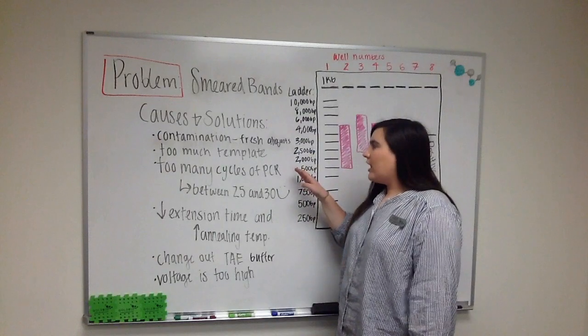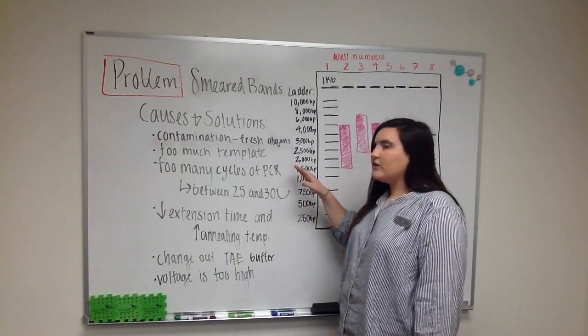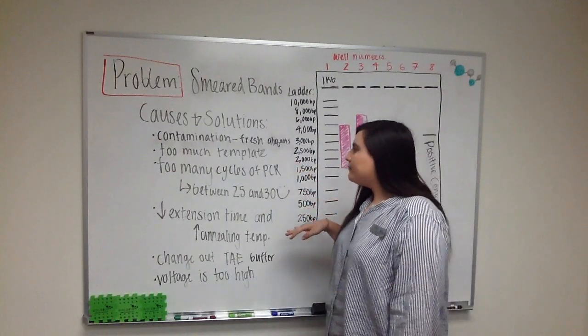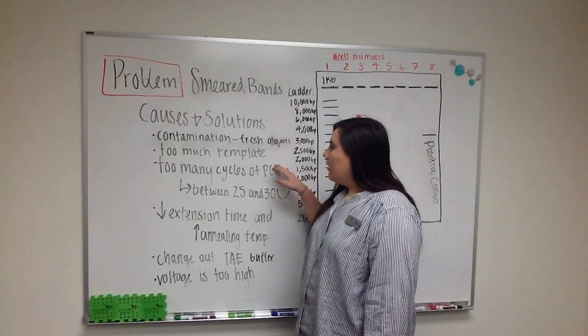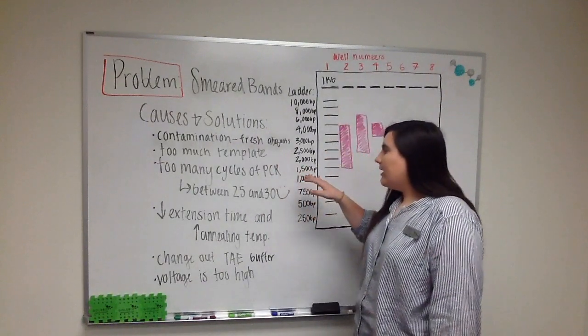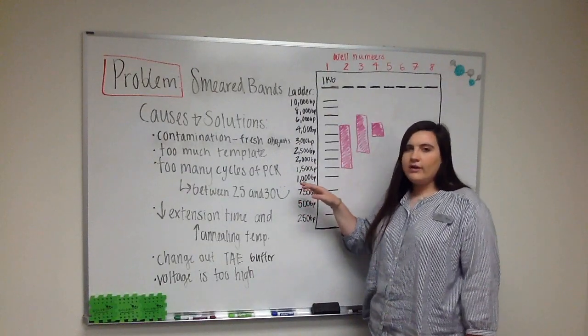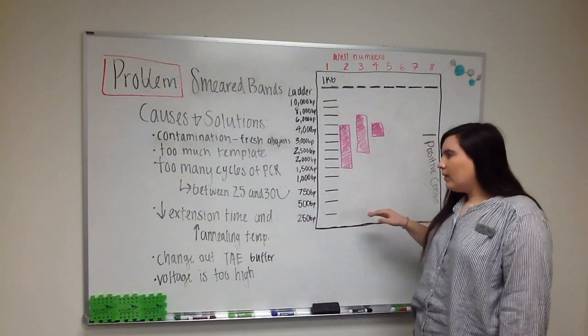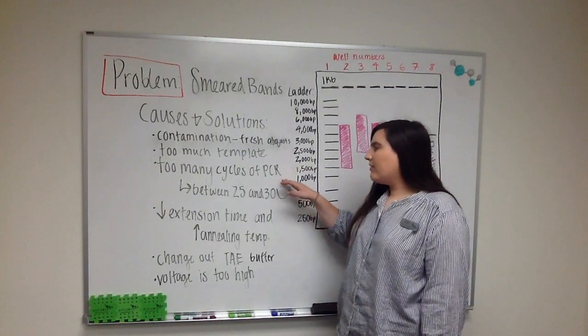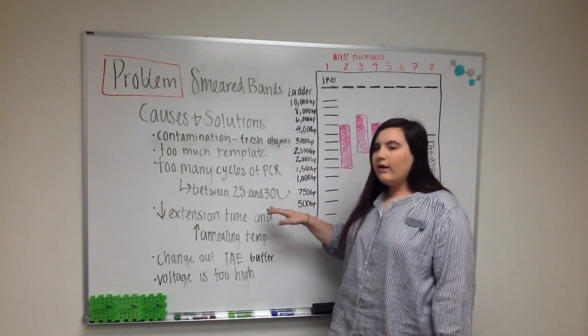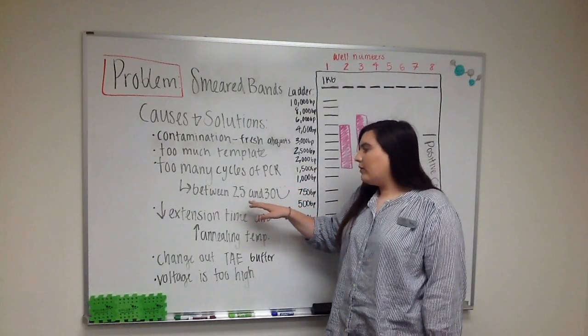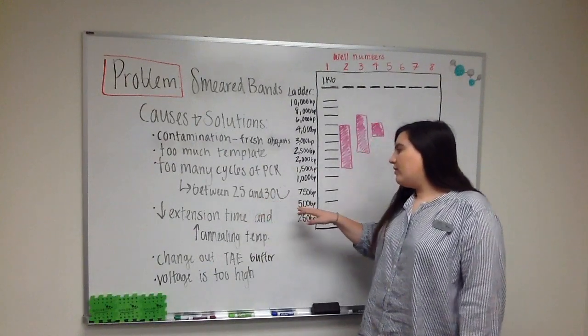I would recommend using fresh aliquots and using those fresh aliquots to run a new PCR. You can also have too much template DNA so I would recommend reducing that or any DNA overloading in general might give you this smearing effect. You can also run too many cycles of PCR. I would recommend trying to stick with between 25 and 30 cycles.